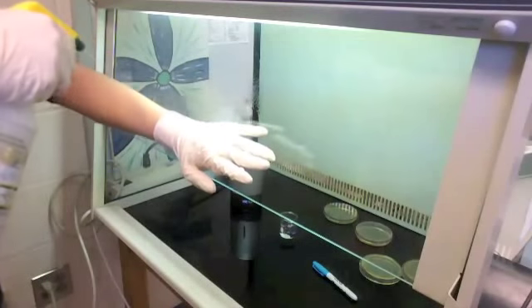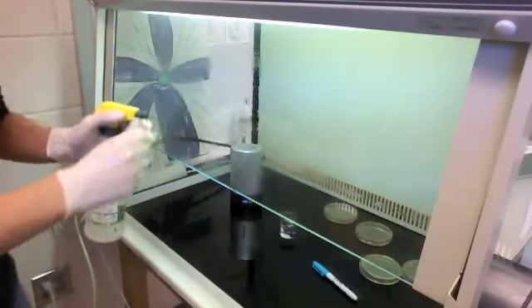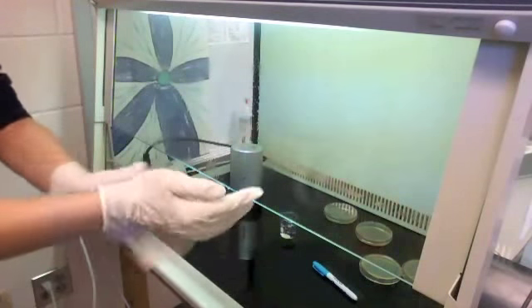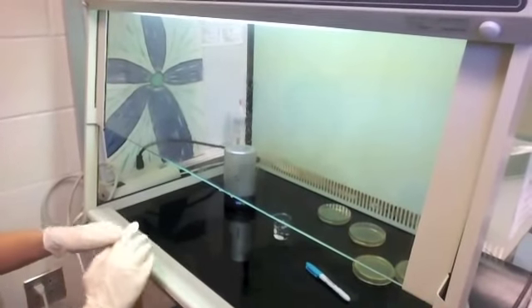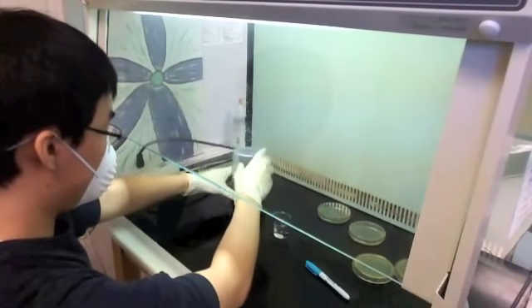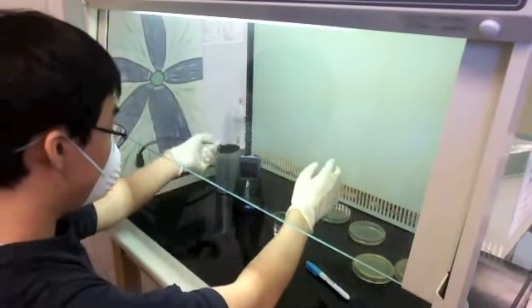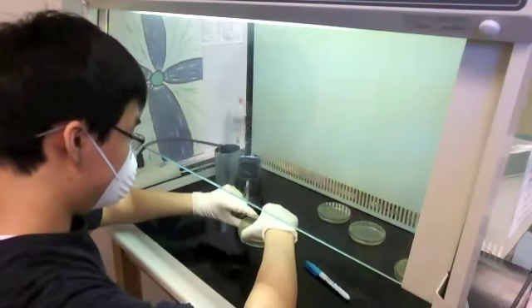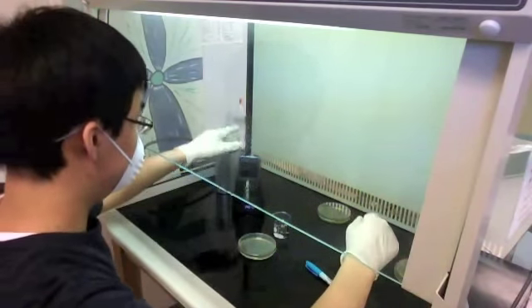I'm going to spray my hands and arms thoroughly with ethyl alcohol again, then rub my hands and arms to make sure the alcohol is covering them so no bacteria enters the flow hood via my arms. Sorry for that camera bump — but now I'm going in again. I'm taking the UV cell phone sanitizer, opening it, and withdrawing my iPod — actually, not yet. I'm taking the 'after' plate first and flipping it over.